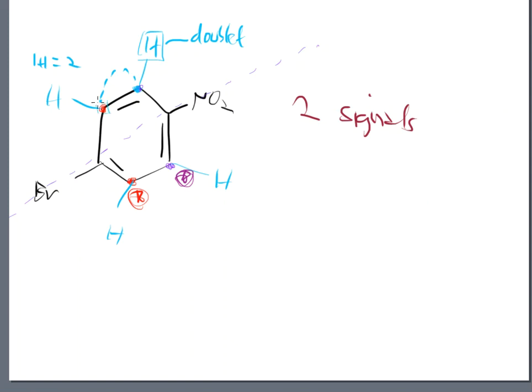So then we move on and we go to the next carbon that I would get the signal from. And that next carbon, well, I do the same thing. I would go to the right-hand side and say, how many kids you got? And they say, I've got 1 miserable kid and 1 miserable parent. So 1 plus 1 is 2. So this is also going to be a doublet. Now, I don't take into consideration the other side of the molecule. And the reason is because they are equivalent. And remember what we said, equivalent signals do not split each other. So I've taken care of one, and I do not have to take care of the other one. That is as simple as NMR is going to show.